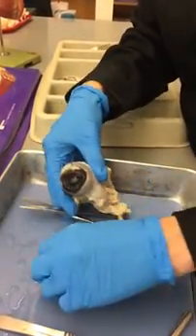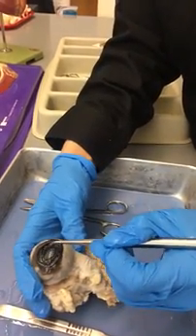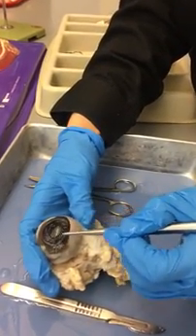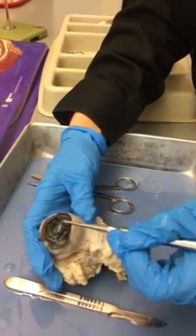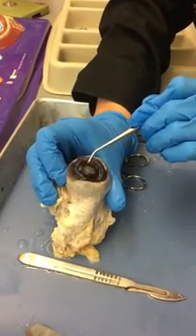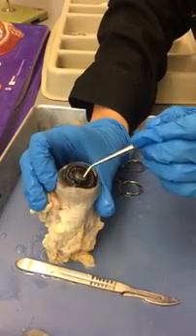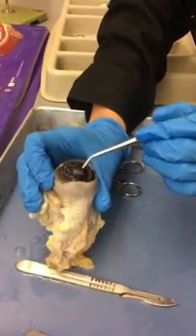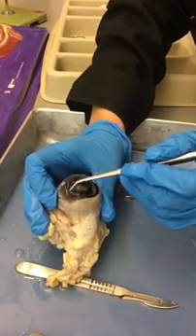Okay, so now I took off the cornea right here. This dark layer that you see right here is going to be the iris. The opening is the pupil, and behind that is the lens. The pupil looks a little bit different with cows and sheep. They're not perfectly round shaped like ours. They're going to be more oval or square shaped. So what I'm going to do next is cut around the iris so we could see the lens.